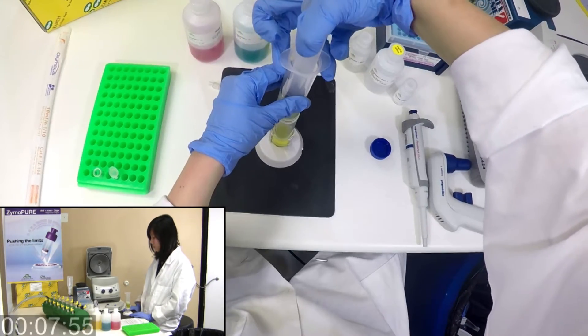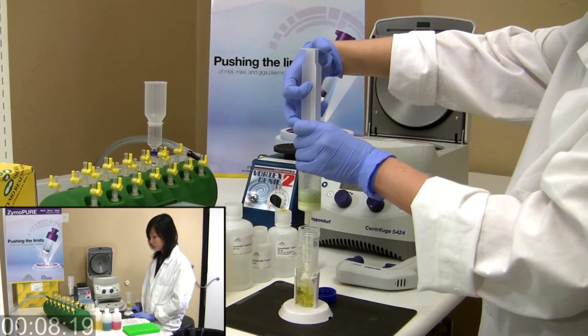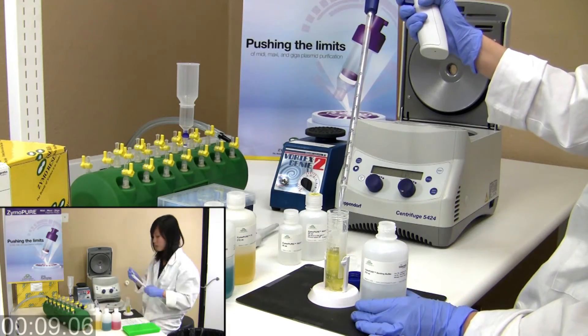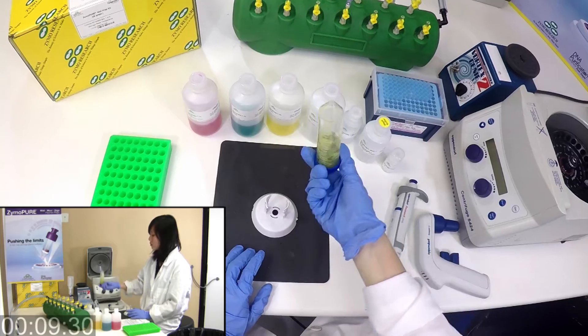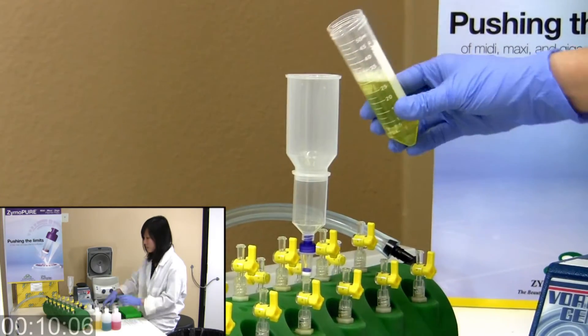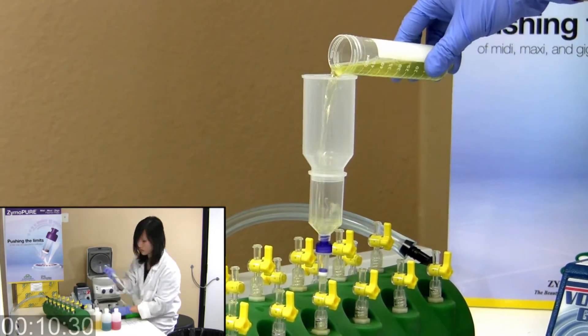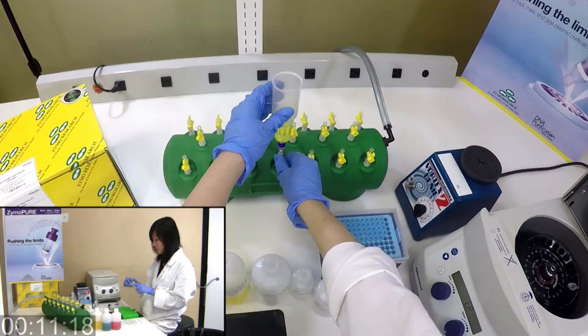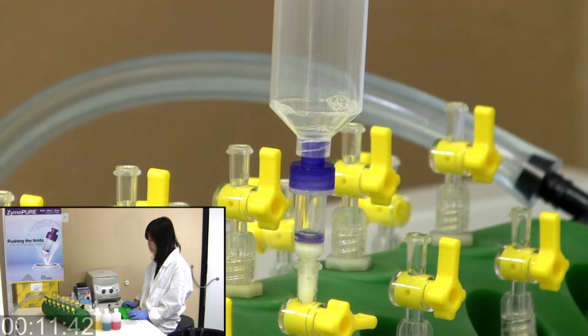Clear the lysate with a simple filtration step using the included syringe filter. Add the ZymoPure binding buffer, mix, and transfer the entire solution to the column assembly. Bind with rapid loading onto a spin column using a vacuum manifold or centrifuge.